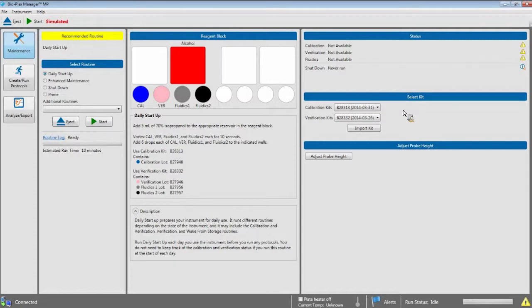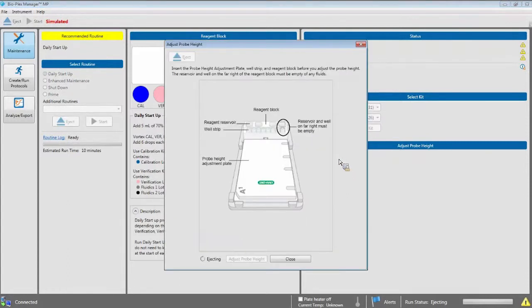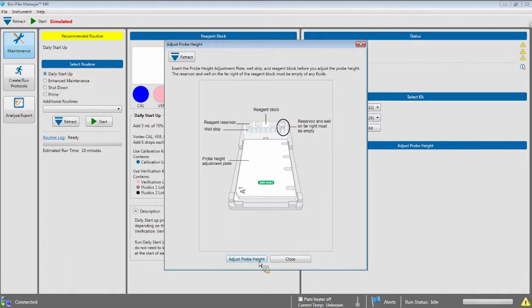If you have a new calibration or verification kit, you can import the lot-specific data using the import kit button. Simply insert the CD that comes with the kit into the computer CD holder and click the import kit button. The last section lets you adjust the probe height. You will need to do this if you change or clean the probe for any reason, or if you intend to use a new type of plate. Simply click the adjust probe height button, and insert the probe height adjustment plate, reagent block, and well strip as indicated, then click adjust probe height.